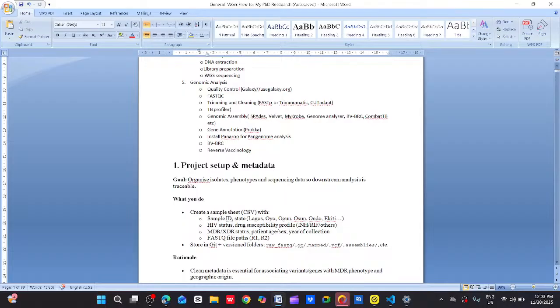So knowing fully all this, we actually needed to proceed further so that you'll be able to see it live, the way we will try to continue to carry out Panaroo.